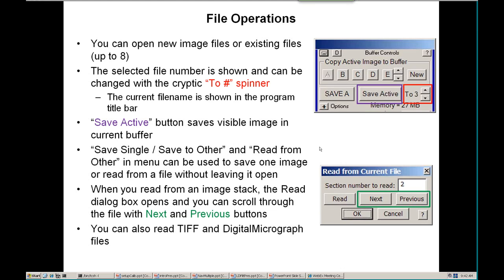In the file menu, there are two entries for doing single image operations into other files without having to open or leave them open: Save Single (or Save to Other) will save a single image, and Read from Other will read a single image from another file. When you read from an image stack that is an open file, a read dialog box shows up which is handy for scrolling through the images. You can also read TIFF and Digital Micrograph files using Read from Other, since it will be looking for a single image in those kinds of files.